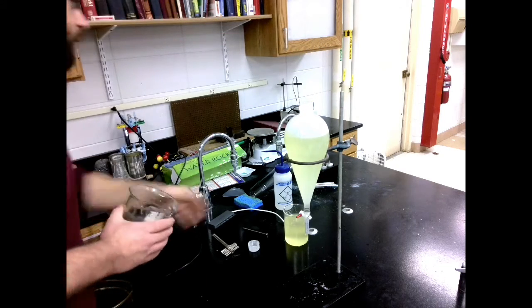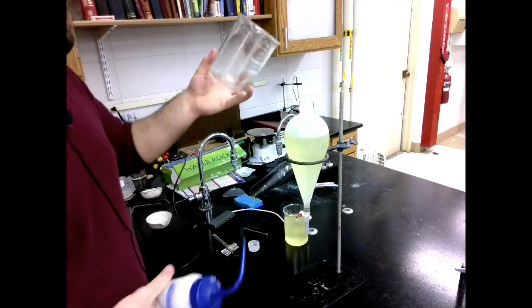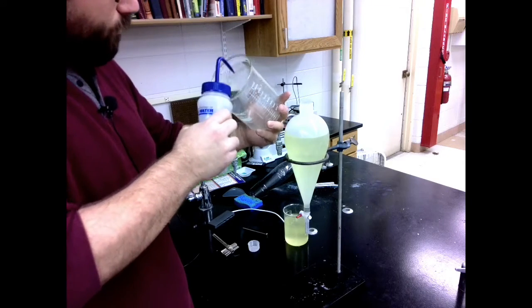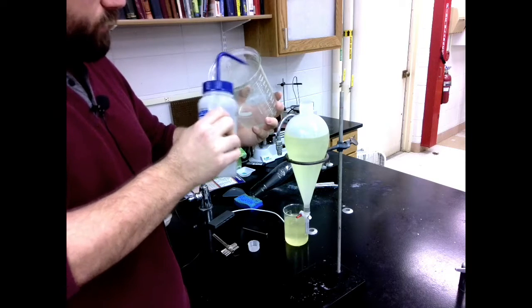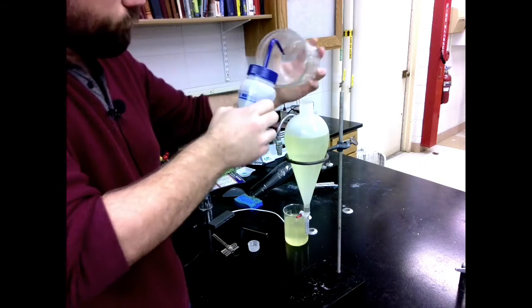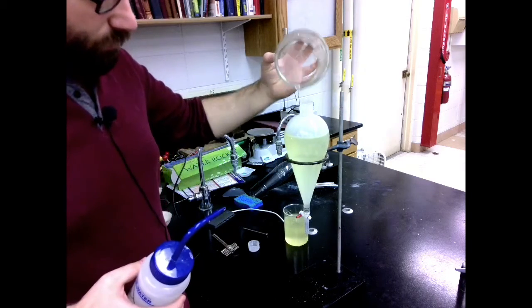And then I'm going to use a wash bottle to try and get all of the extra oil that's clinging to the sides here, because there might be quite a bit of it. Just basically using the wash bottle to kind of push that oil around. I'm going to collect as much of that as I can. Well, that was a waste. Oh well.